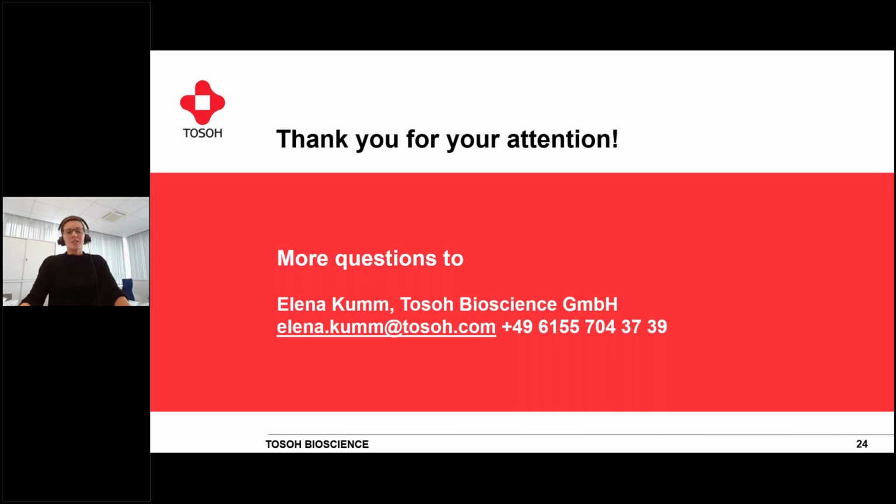What is not good would be HIC. This is nearly impossible to use for MS because you have such a high amount of salt that it's just not a good idea. I was working with MS and I know what salt does. It's not good.